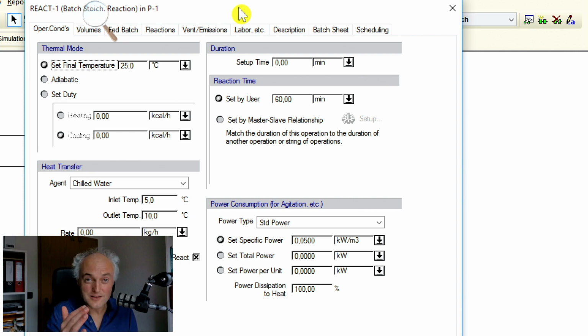The cool thing about the software is, as soon as the mass is balanced, the software doesn't care anymore. So you can trick a bit. You will see later on how this can get important. But if it's a reaction like this one, there is no doubt about the overall stoichiometry, and it's your job to give the software the correct stoichiometry. Otherwise, of course, all that will come out is rubbish. So it's important to set that correctly.